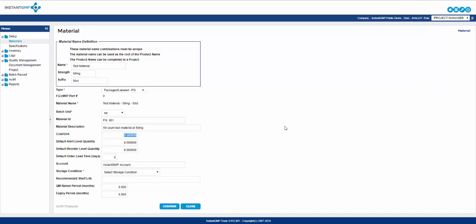Cost per unit allows you to place a numerical value for how much it costs to purchase or sell a piece of inventory per batch unit. Default alert level quantity is utilized in our automatic report system which will send selected users an email notifying them inventory has hit the alert limit and should be monitored for repurchasing soon.